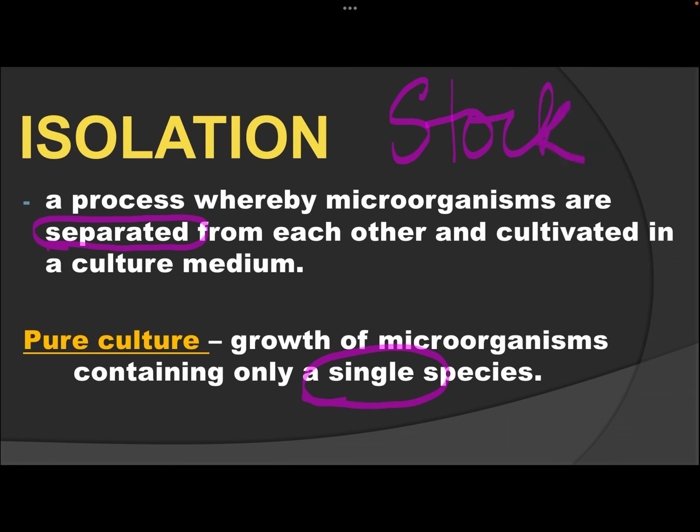If you are doing research or you are in the academe, normally they would stock a pure culture. They would keep it, store it in the recommended temperature and environment, to make sure that the stock culture only contains one single microorganism and is not contaminated.